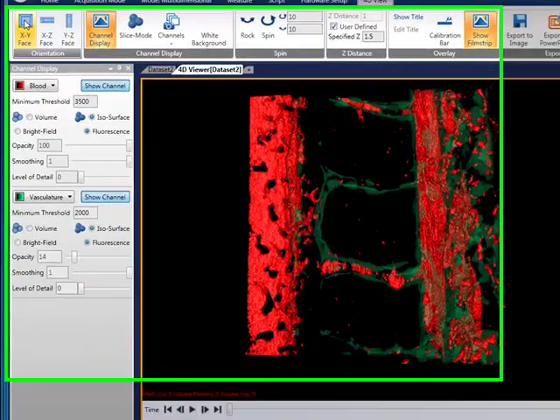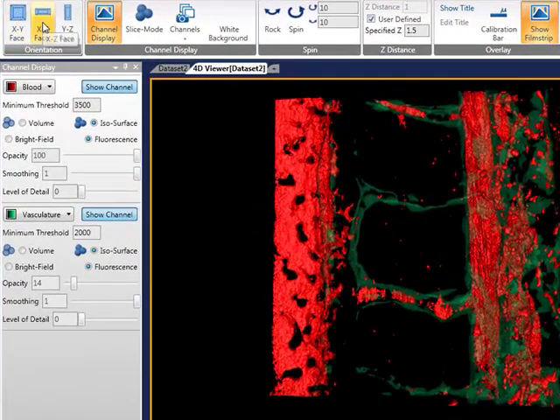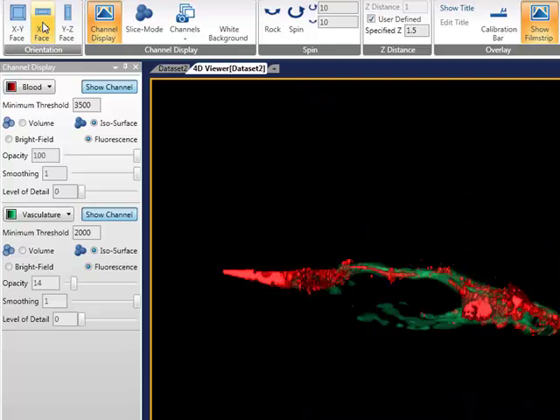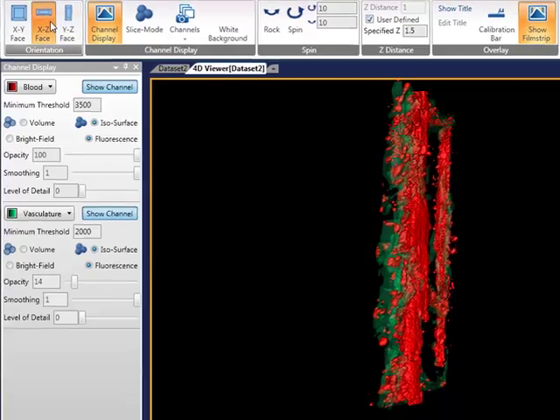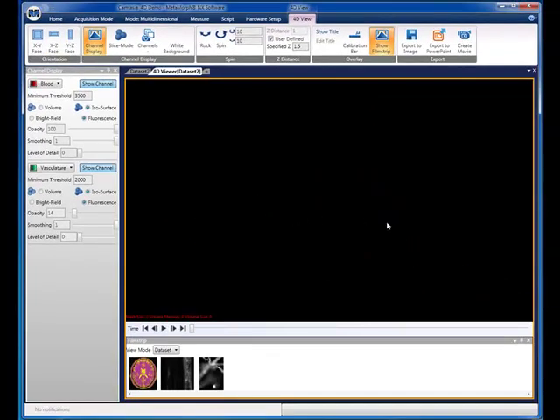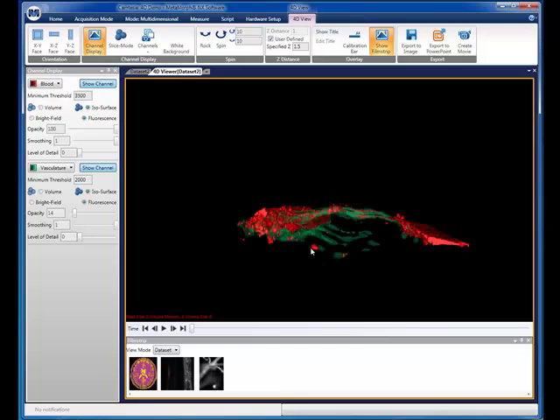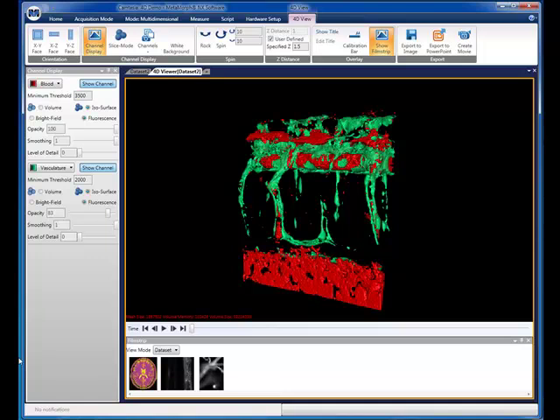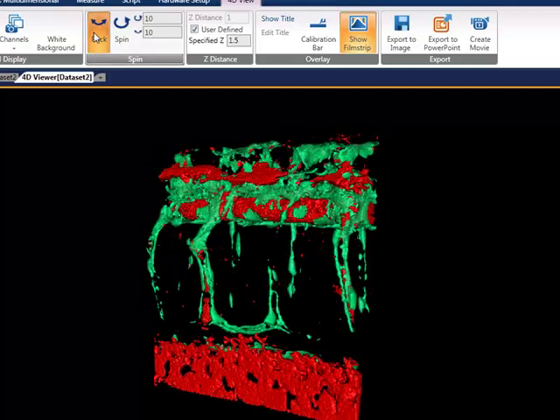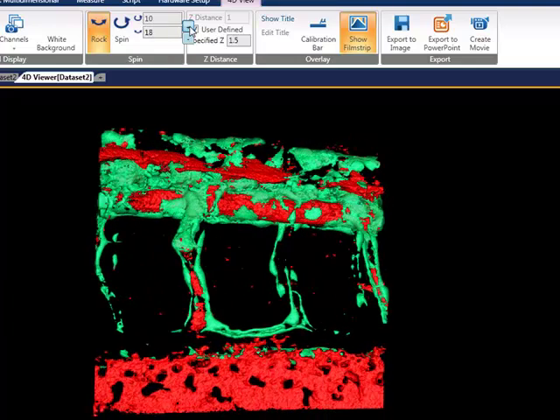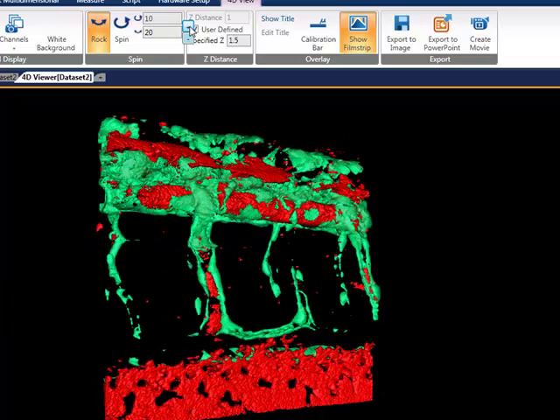Also included on the 4D tab are facing buttons. These allow you to quickly reorient the data along the axes and are very useful if you find yourself lost in the data. Also included on the 4D tab are the rock and spin controls. If rocking, you can control the angle of rotation and the rock speed. If spinning, you can control the speed of rotation.